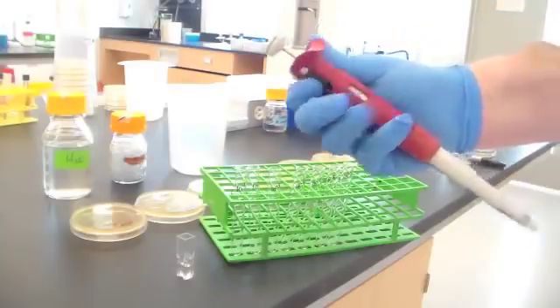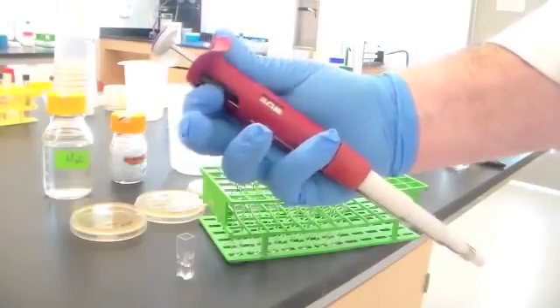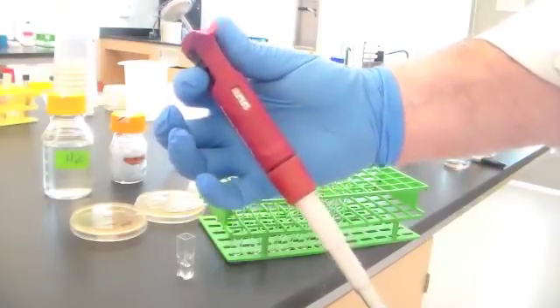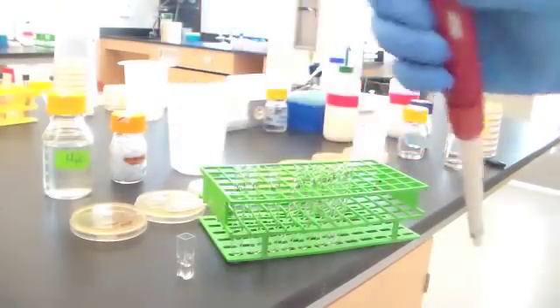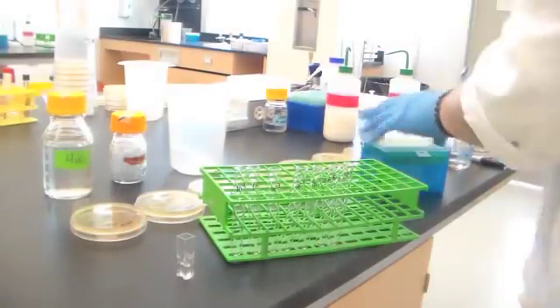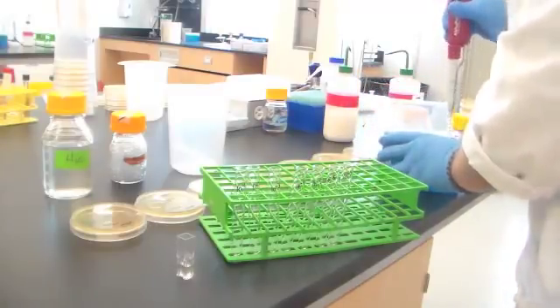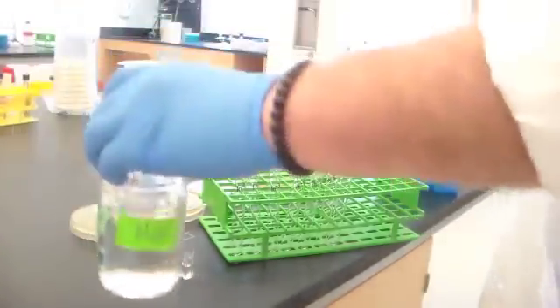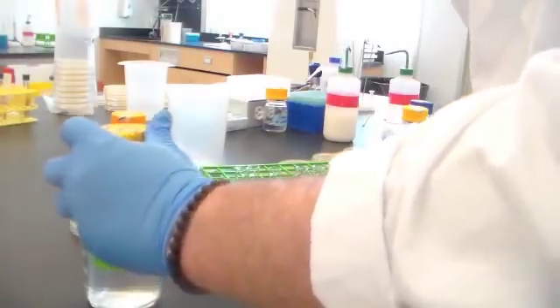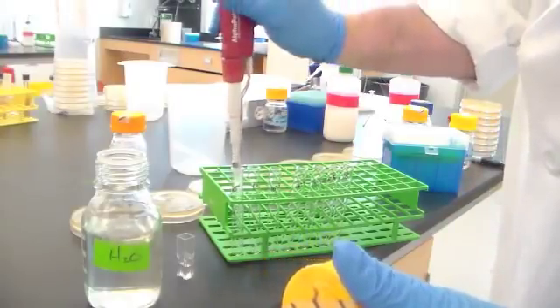So the next thing that I'm going to do is to set the pipettor to 9/10 of a mil, 900 microliters. So 0 in red, and then 90 is 0.9 mils, or 900 microliters. And now I also have out autoclaved sterile distilled water. I'm now going to transfer 900 microliters into each one of these tubes.